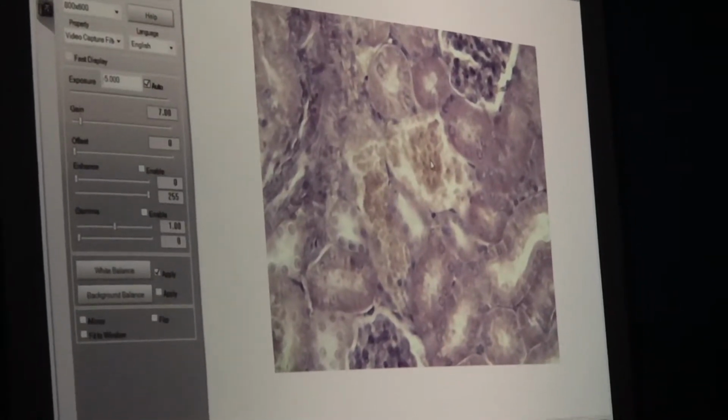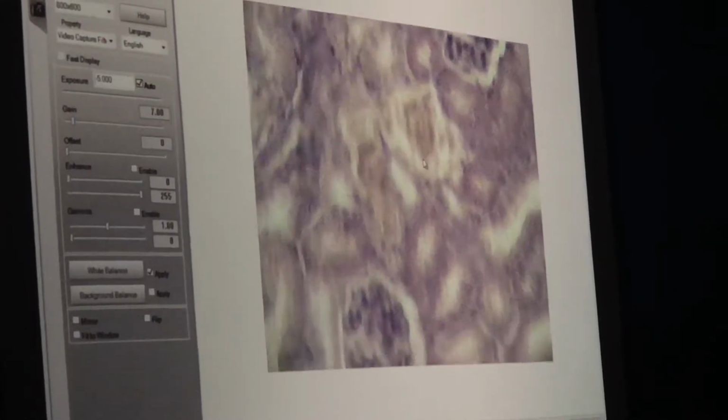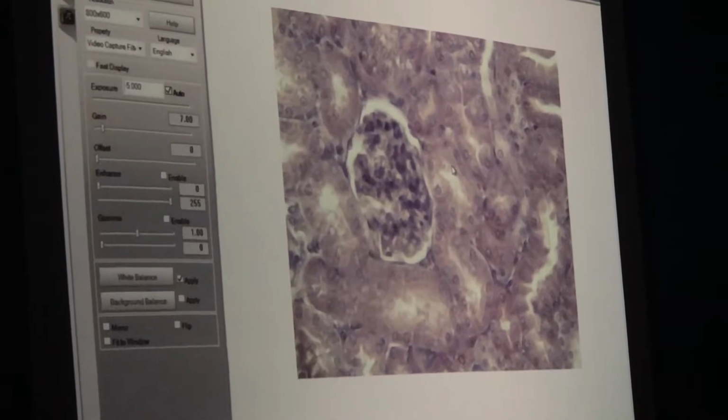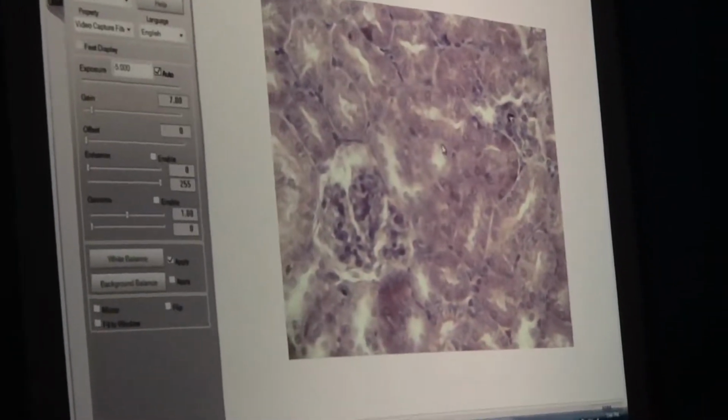I don't know what that is. That could be one of those, remember we had a whole series of branching blood vessels that came into and went out of the kidney. It's probably one of those. We don't have to identify them. Seeing if I see anything.